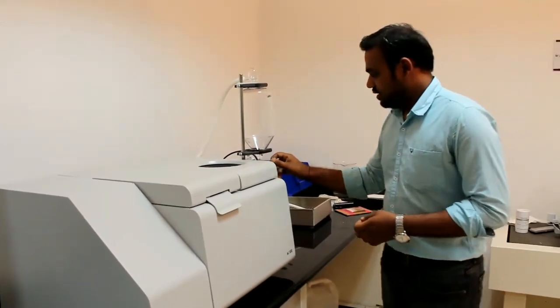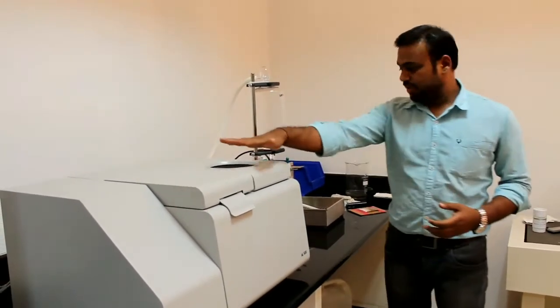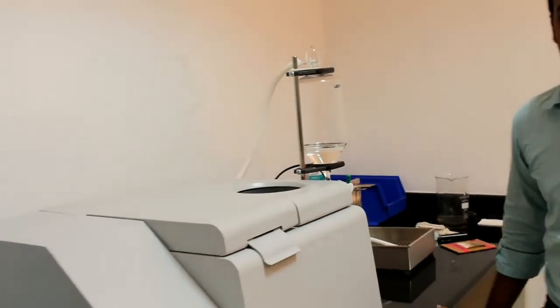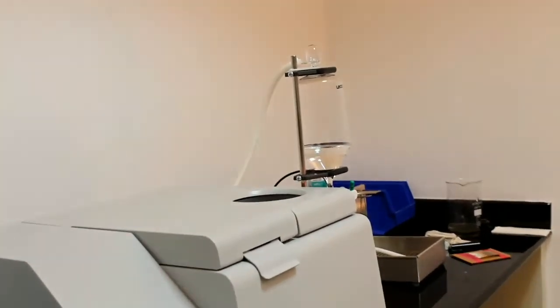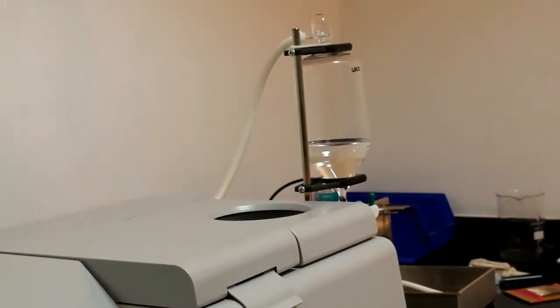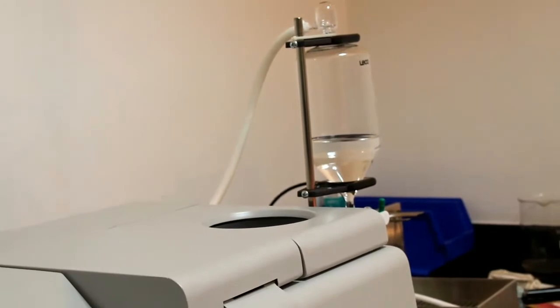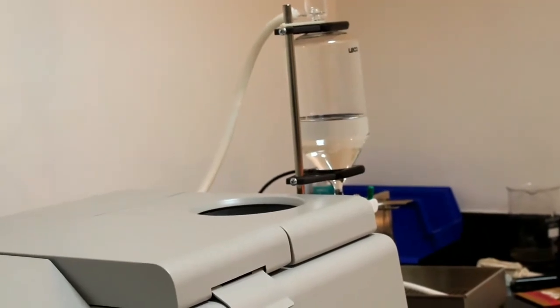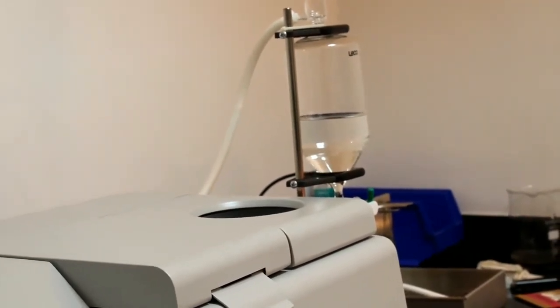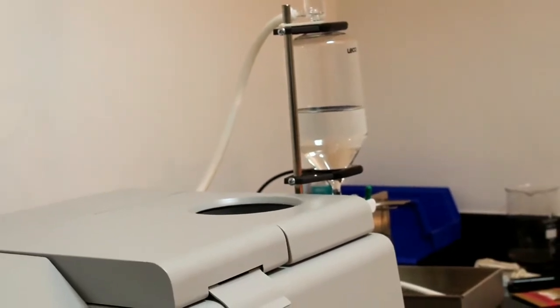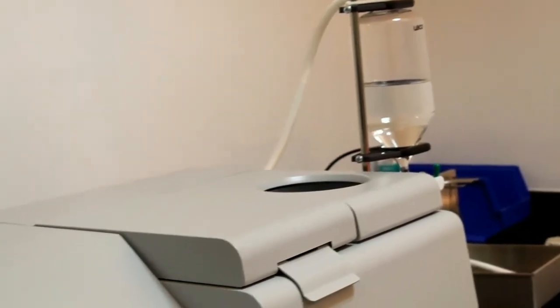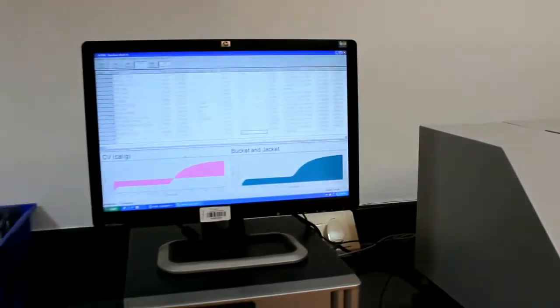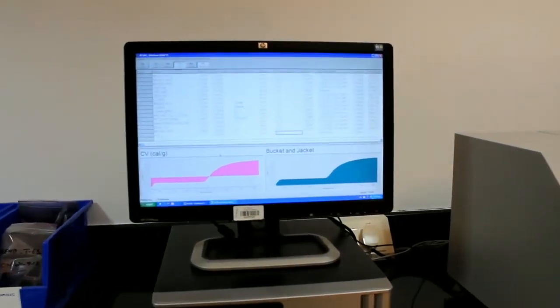We can rotate this, the water will be continuously rotating in the instrument. We can operate this in Windows 10, Windows 7, and XP also. We can directly convey the result from this window to Excel. By sample by sample, it will append the result to the Excel also. This is a huge advantage for user, so that each and every after analyzing, the result will go into the Excel sheet.